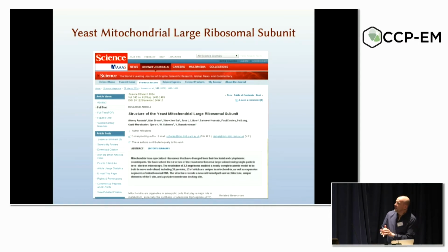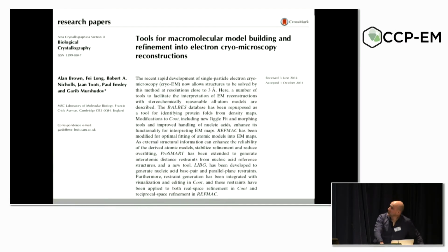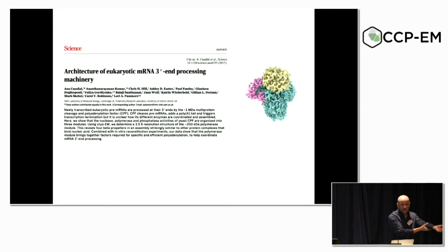So my eyes were opened to the needs of Cryo-EM by conversations with my colleagues Alan Brown and particularly Alexei Amunts, who collected high-resolution mitochondrial ribosomal subunits. We were encouraged to help them out by changing our software to help them do the model building of the ribosomal subunits. We wrote a paper on that. It seems to be quite well cited in the field now. That's nice.